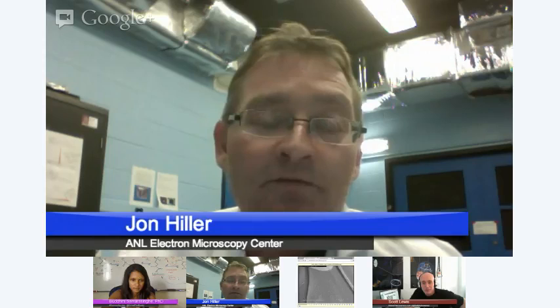And with that being said, the first thing that we looked at, I told you you could put a carbon nanotube across that microbridge. Right. That's how we do it. We use a very, very sharp probe tip and go in and pick a carbon nanotube up that we're interested in, and then move it over to the sample that has the device fabricated with the bridge. And then we use the ion beam with the gas injector, and we glue each end of the nanotube down on either side of the bridge. And then we shut the gas off, and use the ion beam to cut the probe tip away from the sample, so it's free. So we can visualize, but we can also manipulate.